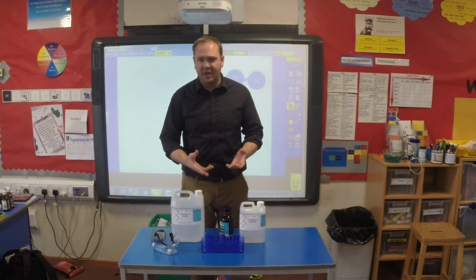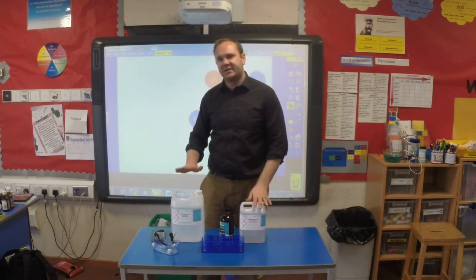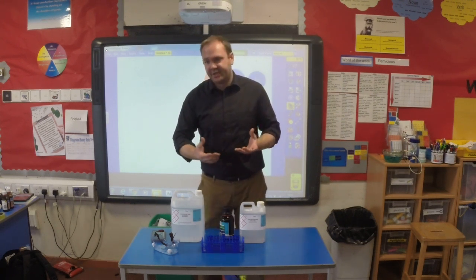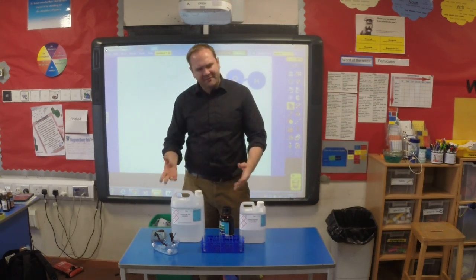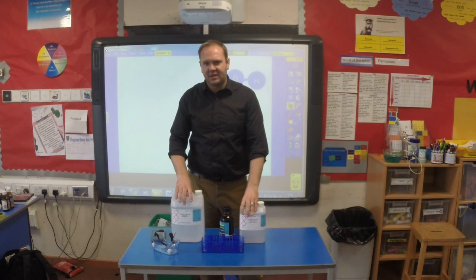So if we combine them, we get the other product of this reaction, which is sodium chloride, or salt in this case. So the other thing that you learn from doing this is every time you mix equal quantities of acids and bases, or acids and alkalis, you get the production of water and a salt. And in this case, it's good old table salt, so sodium chloride. So a really fun experiment for them to try. Very easy to set up. You just need to have the correct equipment, but perfectly easy to do in a primary setting. Cheers.